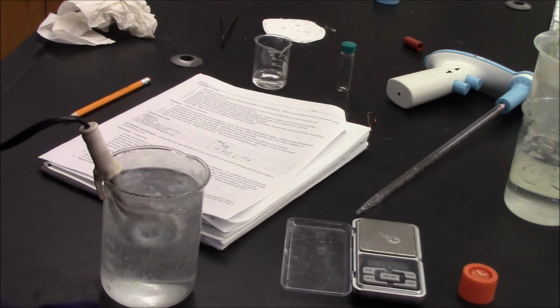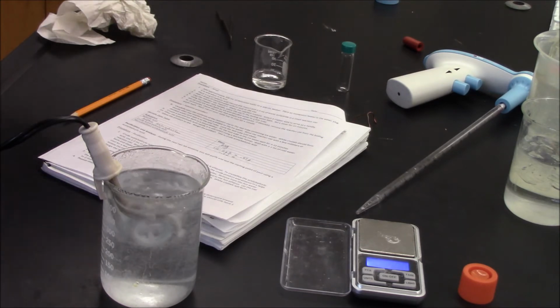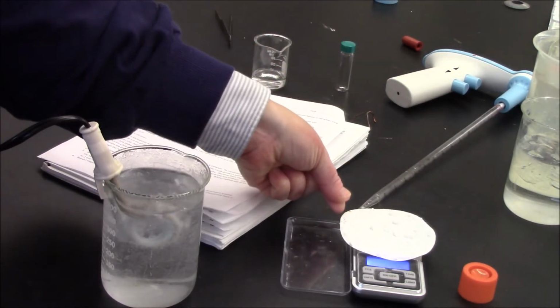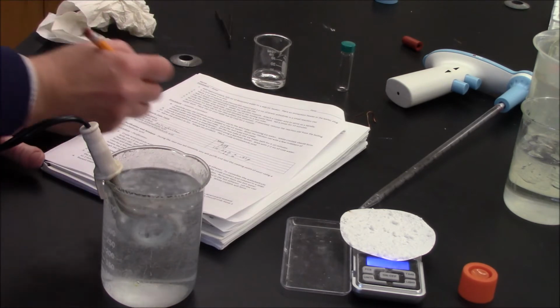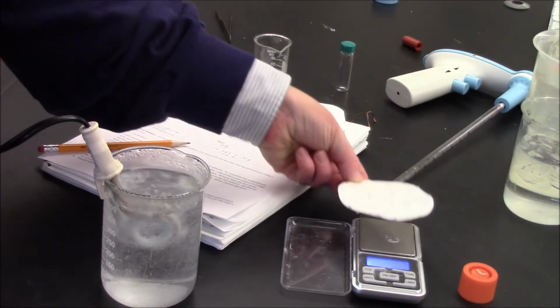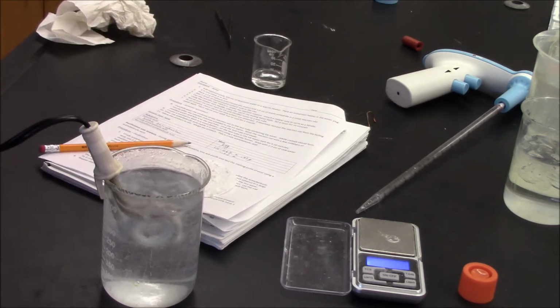Alrighty guys, I'm here and unfortunately I have a class, so I'm going to have to narrate this instead of talking to the camera. My crude product has dried overnight, and now I need to weigh and determine the mass of crude product that I have. I weigh it and I determine that I have a total mass of 1.10 grams, which I record in my data table. The mass of my filter paper alone is 0.63 grams.